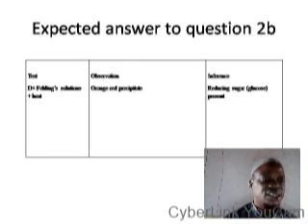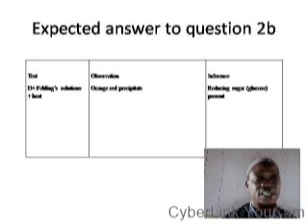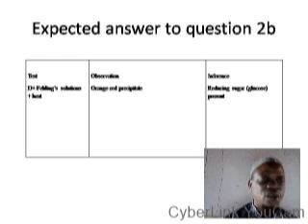That's your test. Then orange red precipitate was observed. That's what we did. That's what we observed that day. And then the inference in that case: when you add Fehling's solution to a sample and you get orange red precipitate after heating, the inference is reducing sugar, or simply glucose, present.